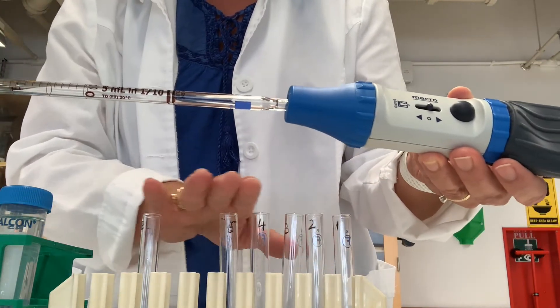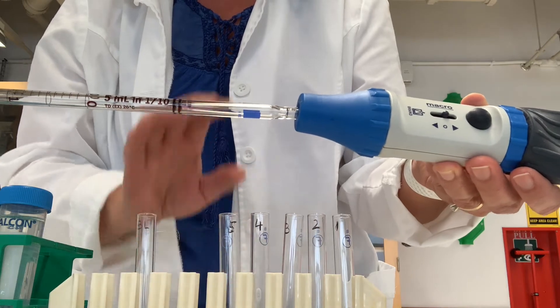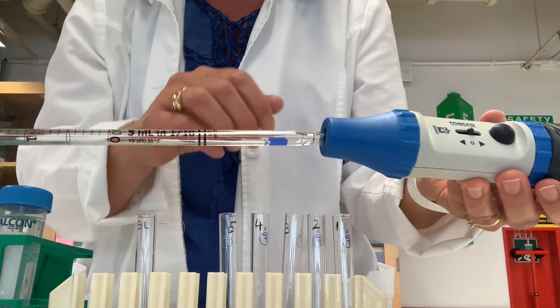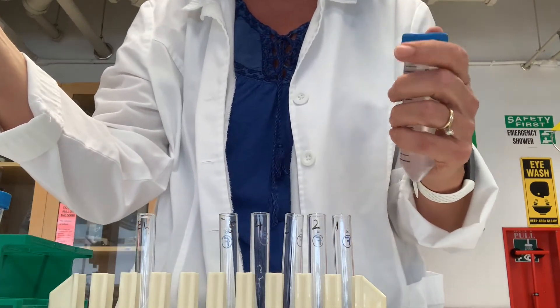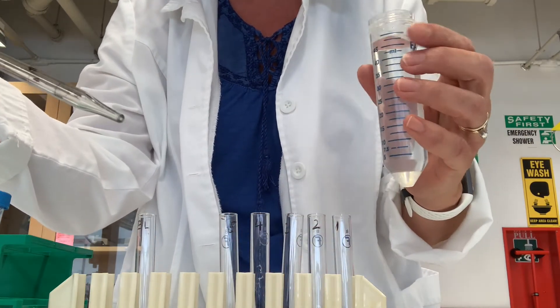I have my pre-labeled tubes and also a tube labeled for the blank, which is going to be water. Our dilution is a simple one-to-one dilution. I'm going to start by adding three milliliters of water to tubes two through five, and six milliliters of water to the blank tube.